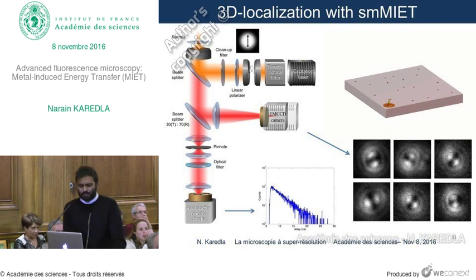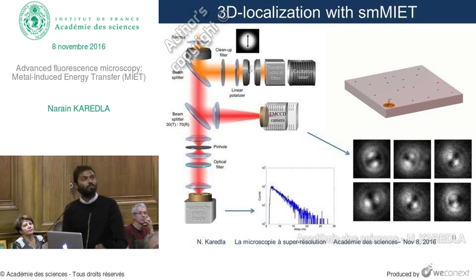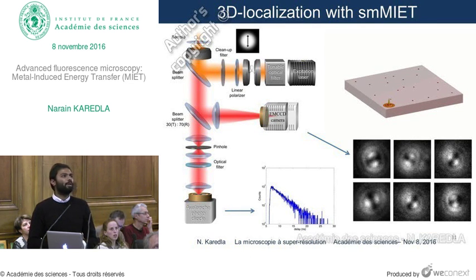Okay, maybe not. So if you see the lifetime modulation curve over the metal surface, it is pretty steep in some areas. For gold, for example, between 40 and 50 nanometers, that is the steepest, whereas it smoothens out as you go higher. So this is the best range, and here, at the moment, we are trying to resolve 10 nanometer or 5 nanometer fluctuations in height.